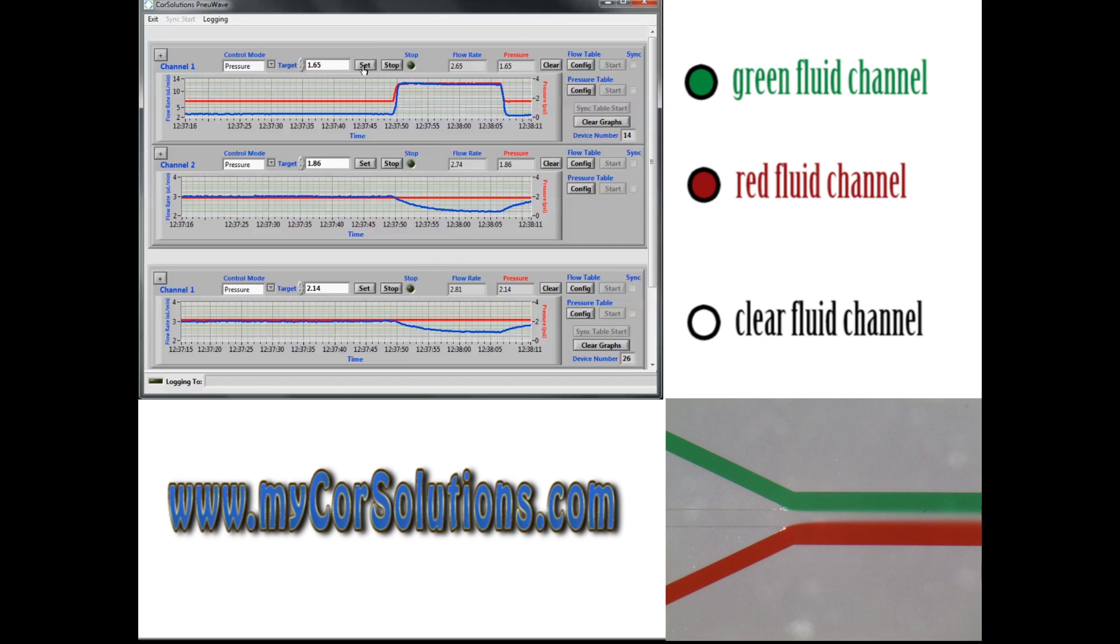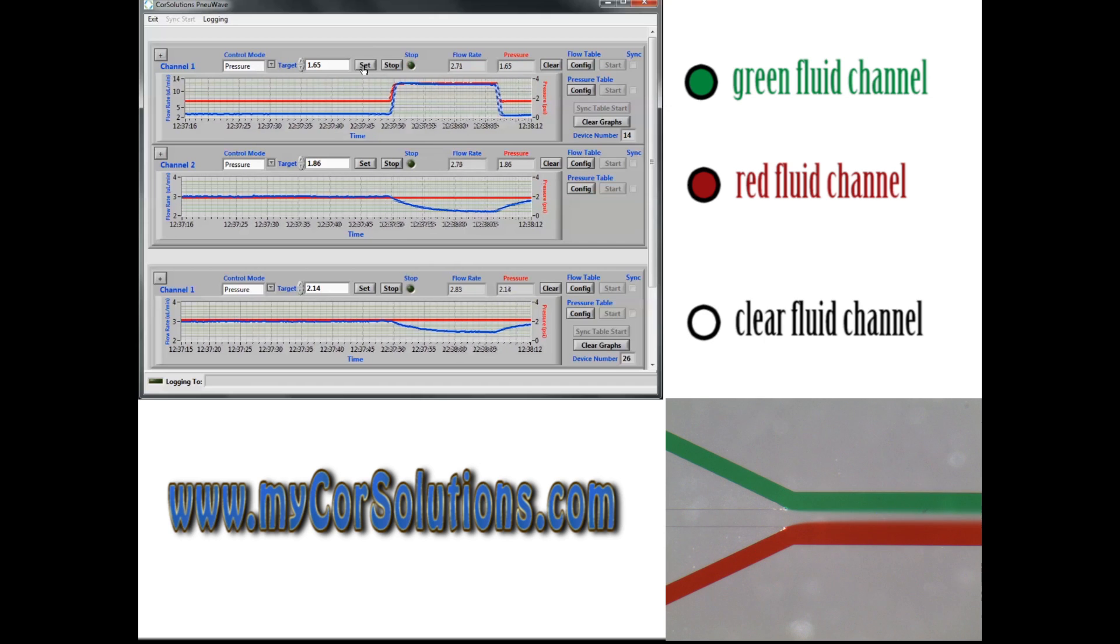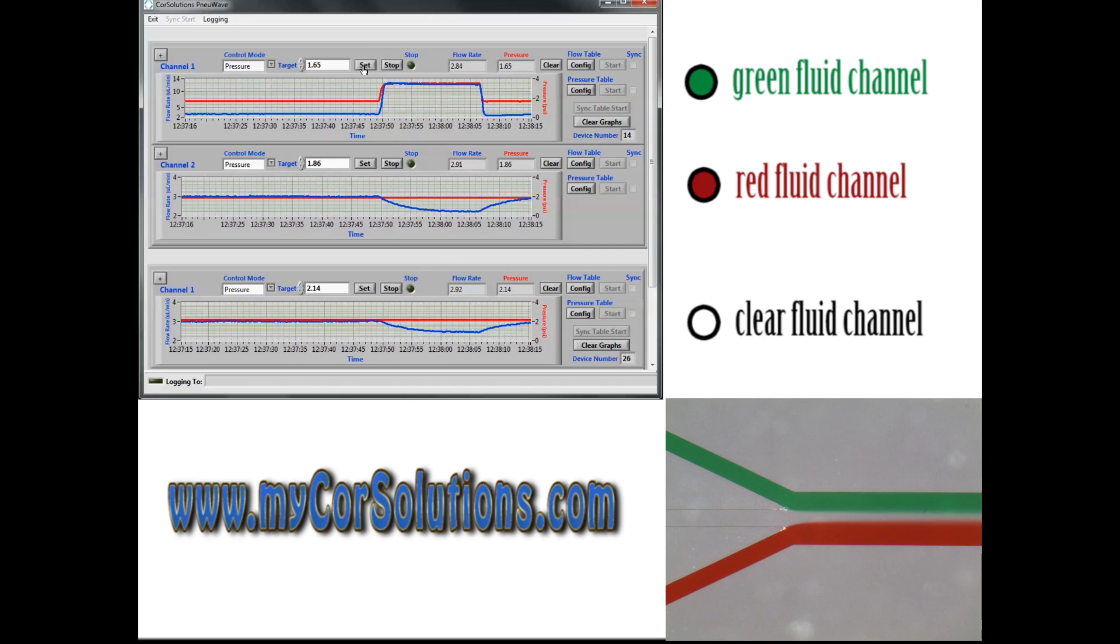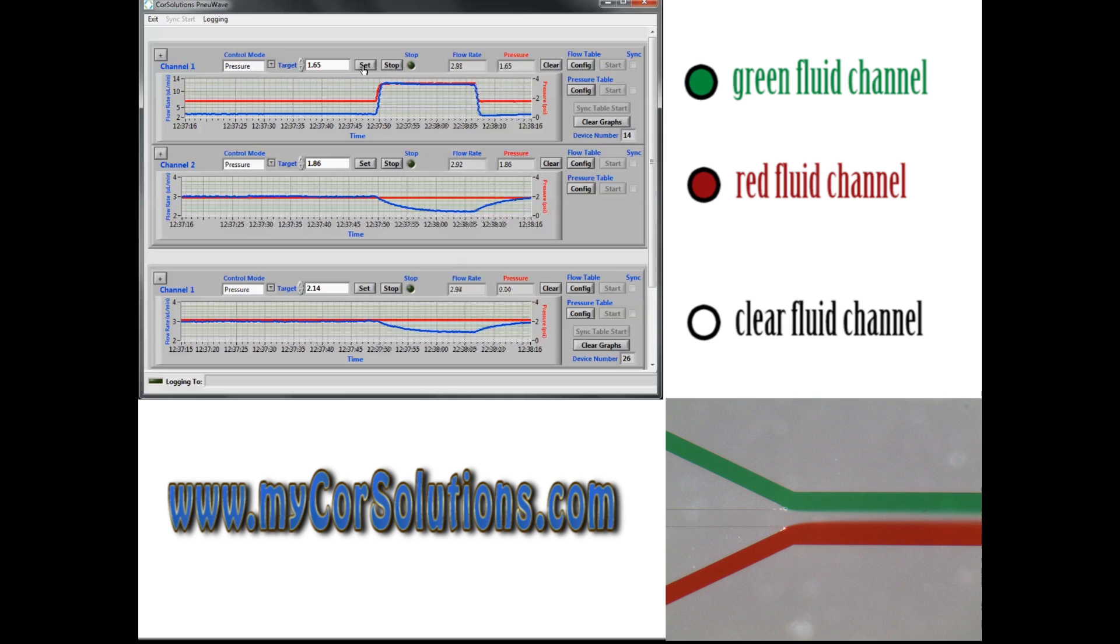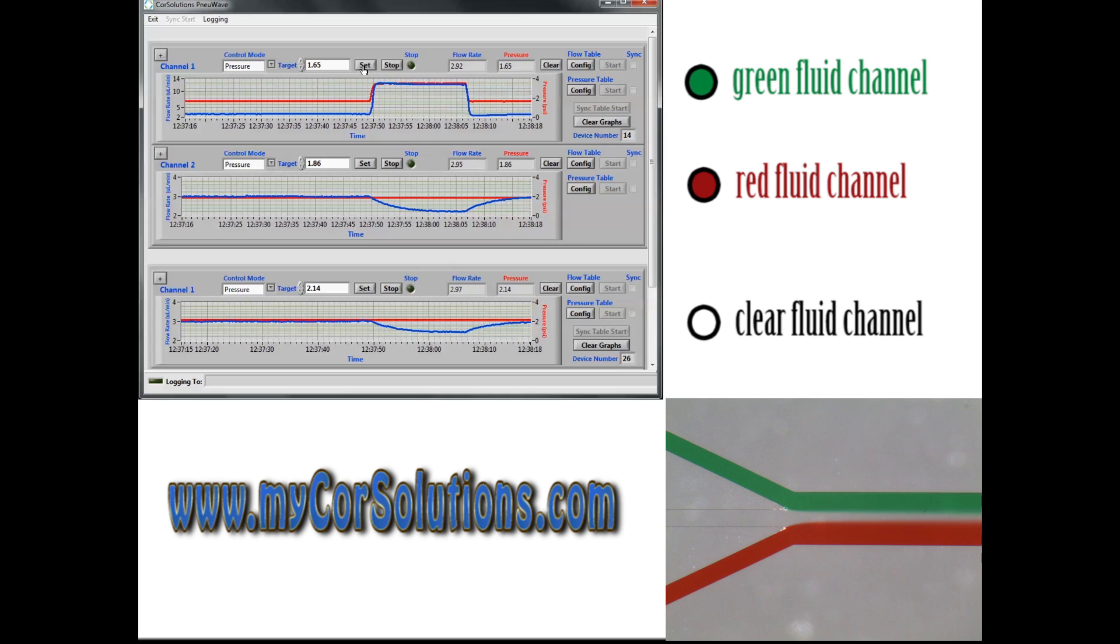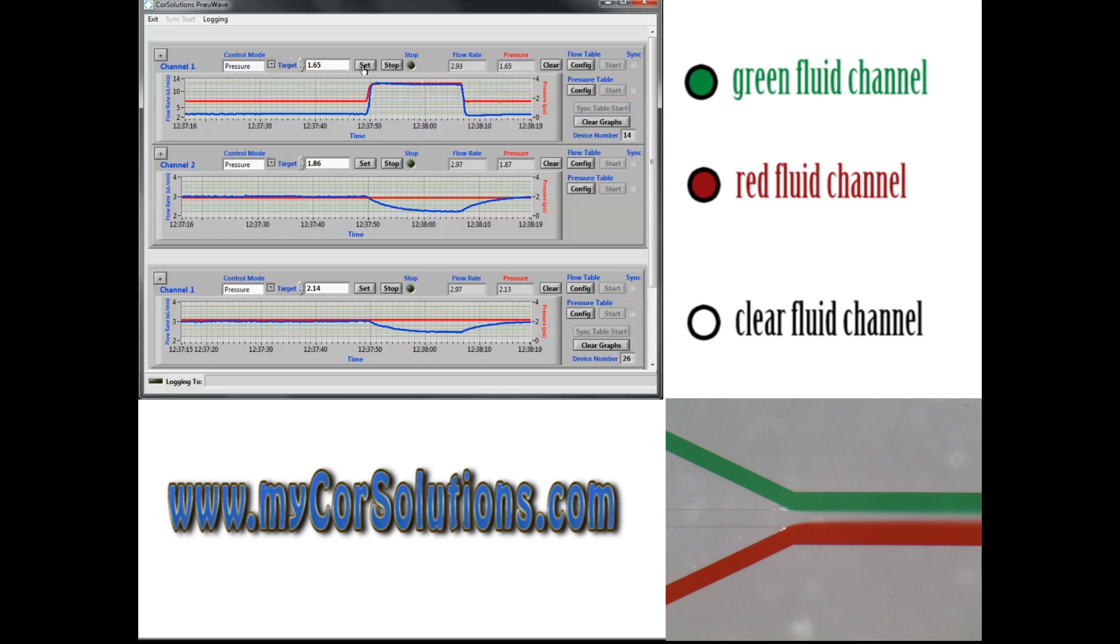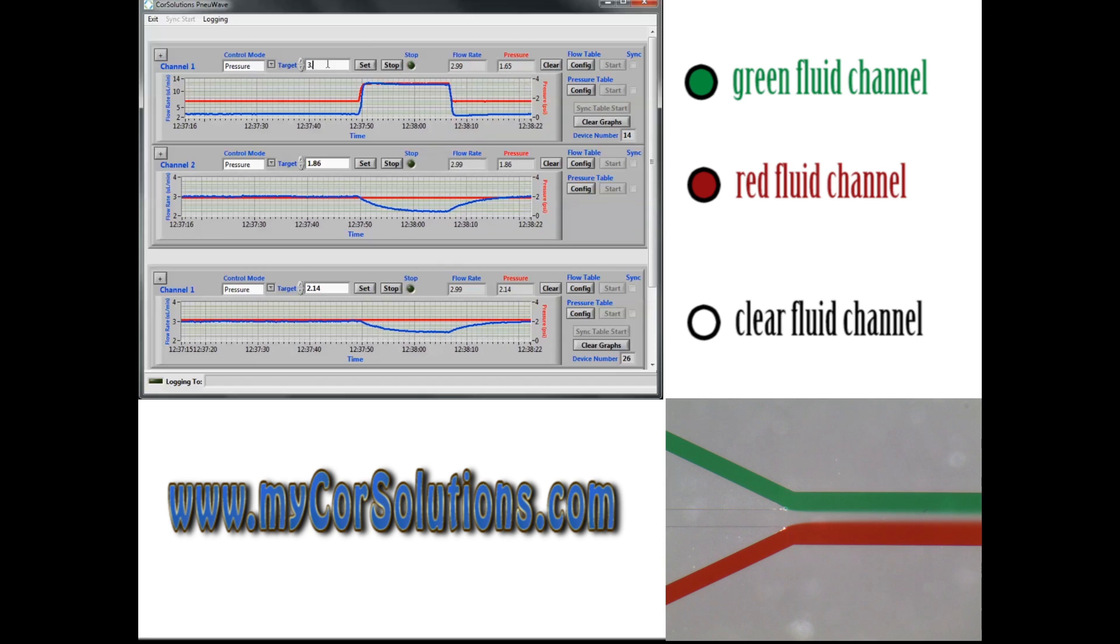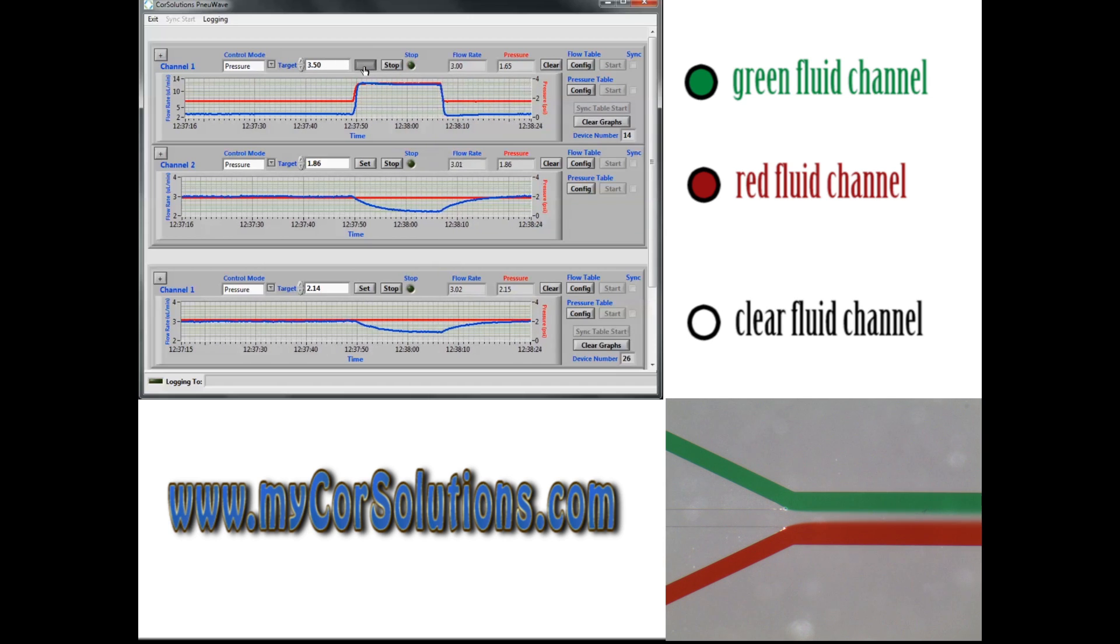Then the set point pressure for the green liquid is increased to approximately double, where the pressures for the other two channels remain unchanged. As expected, this pressure increase causes the flow rate of the green liquid to increase.